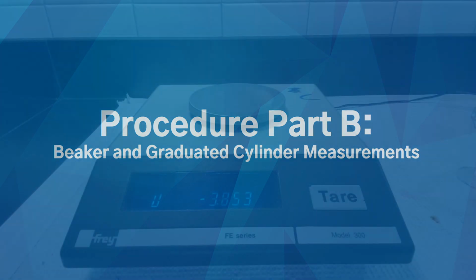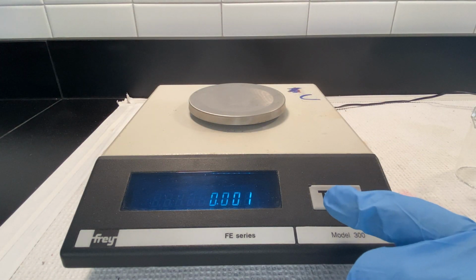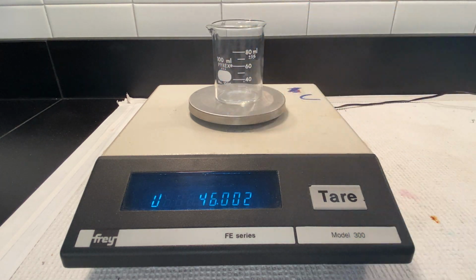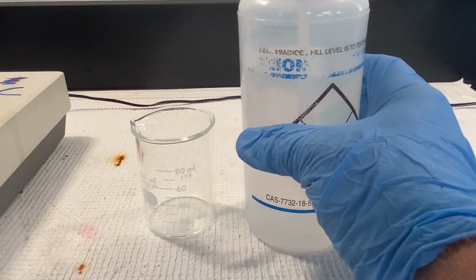Part B is a little more challenging. Here you're going to take mass measurements with both a beaker and a graduated cylinder, but you're going to make each of those measurements two different ways. You're going to make them directly, and then you're also going to determine the volume by using density.